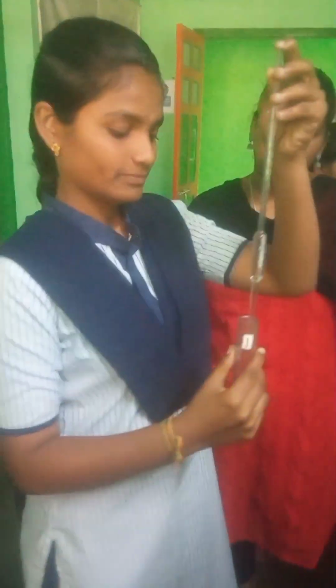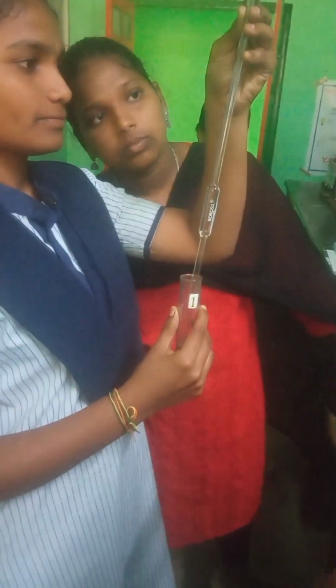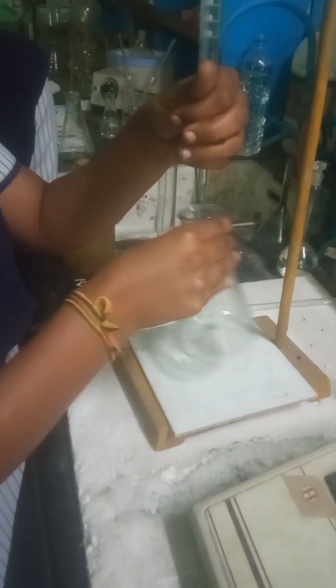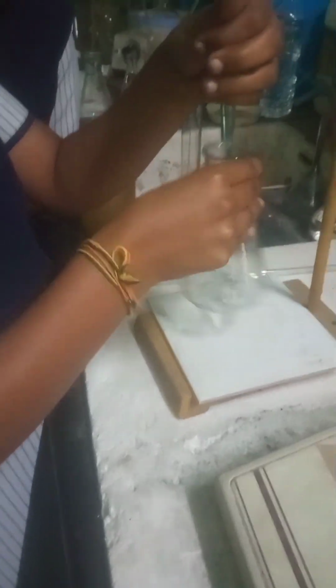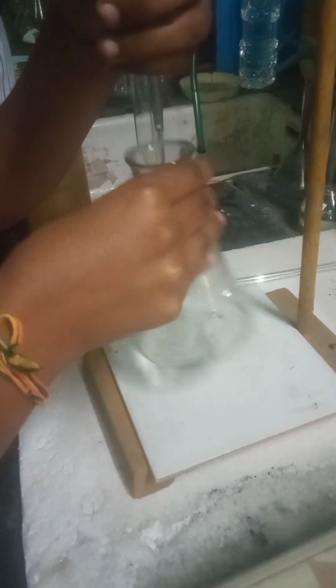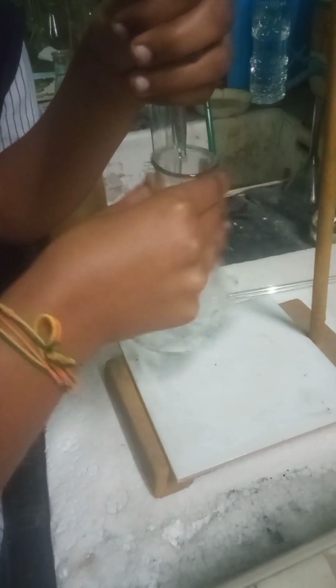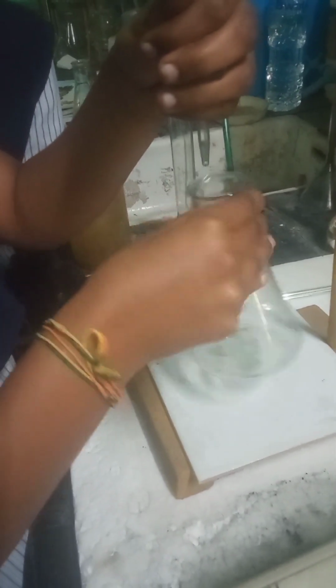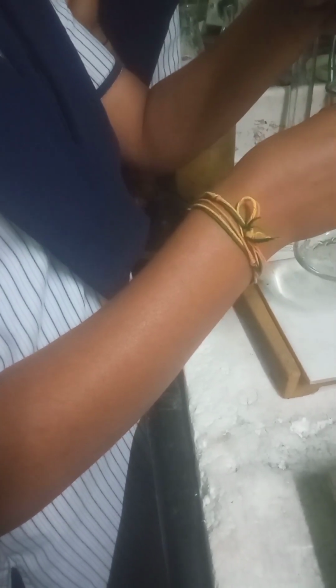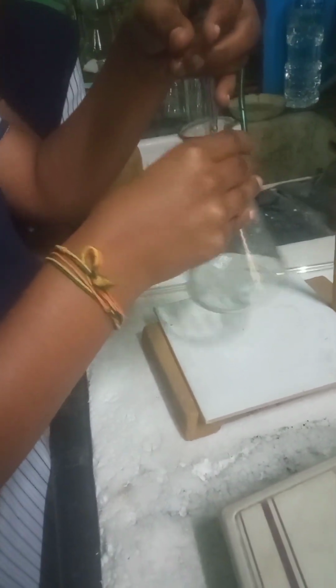After filtration, they are collecting the filtrate, meaning the acetic acid present in the boiling test tubes, which were obtained from the flasks after filtration. Now they are titrating in order to get V1, V2, V3, V4, V5, which were previously mentioned. This is the volume of NaOH required to neutralize the remaining acetic acid. Finally, they found the initial volume, that means pure acetic acid is taken for the titration.